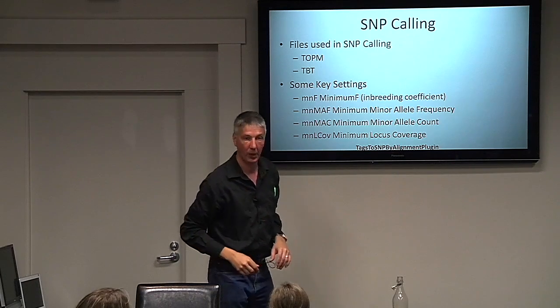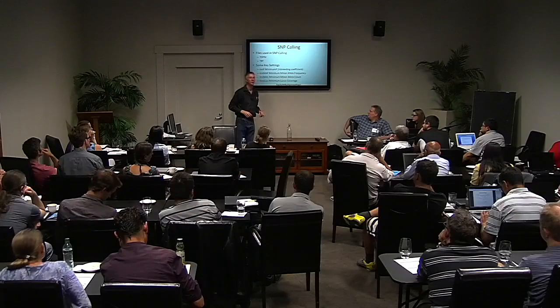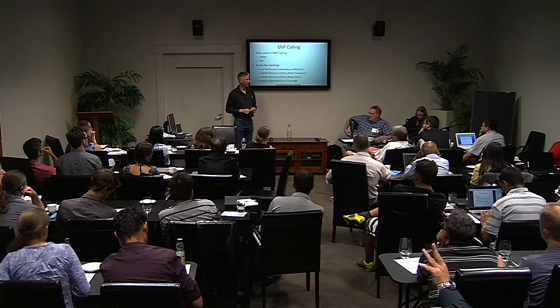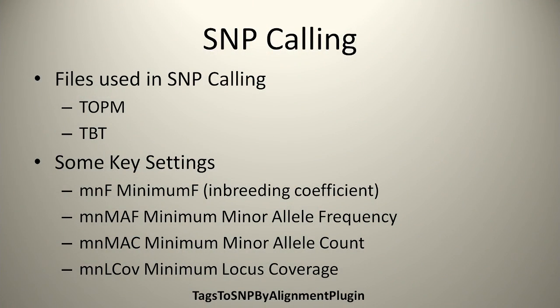Right, but there is an option to include the reference, and I highly recommend that. So there's a -ref option, and then you tell it the path to the reference genome, and it'll pull a tag out of the reference genome at the same spot, which is really good if you may not have a cut site in the reference genome. So you want to make sure it's there. In case there's an insertion or deletion, you can still tell where the SNPs are relative to that reference genome.